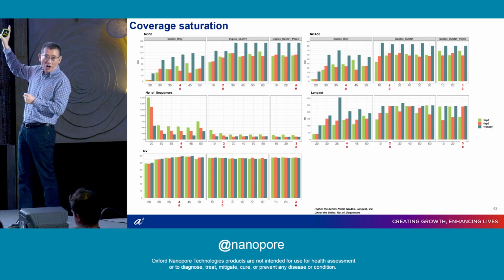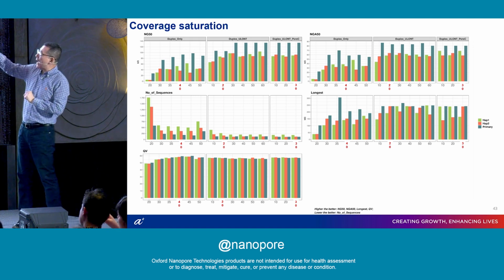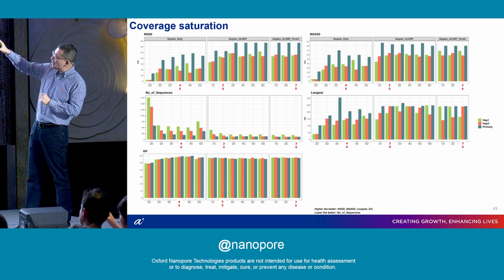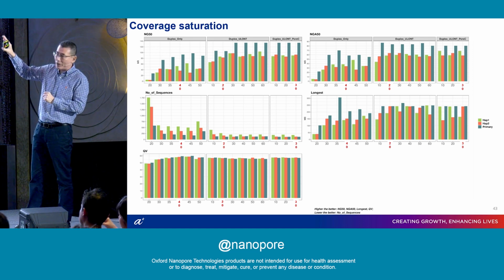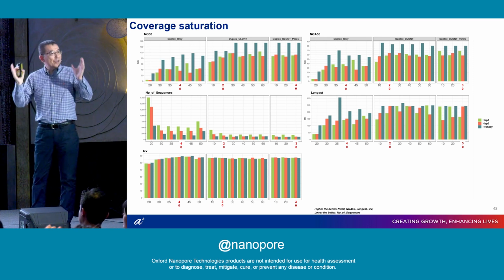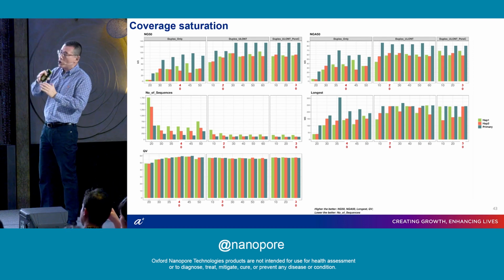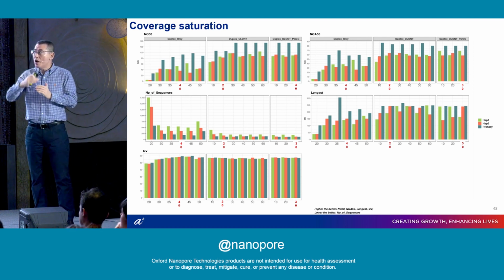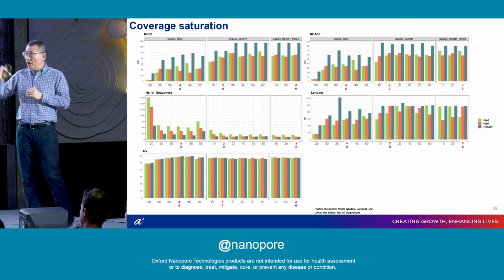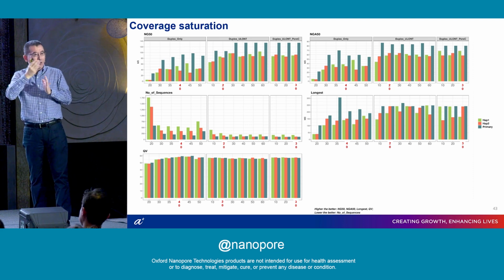Then you can see beyond that, we look at parameters in terms of NG50, the median length of the contig. You can see that after 40x using duplex reads, you really don't increase it, for either haplotype contigs or primary contigs. And if you look at the ultra-long, yes, you will substantially increase the length, but beyond 20x of ultra-long, your performance is slowly saturated already.